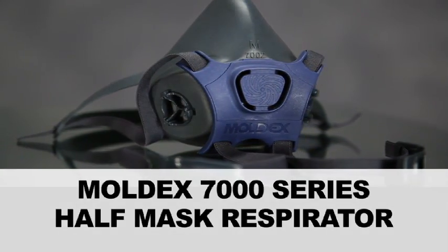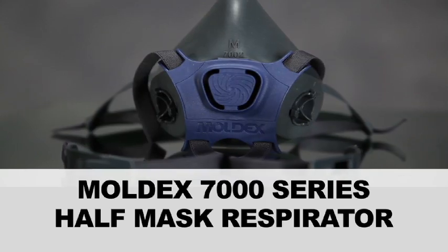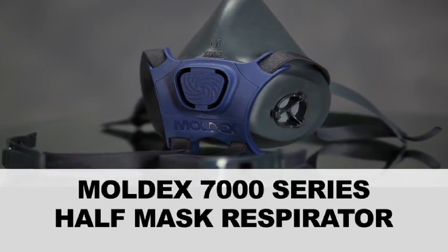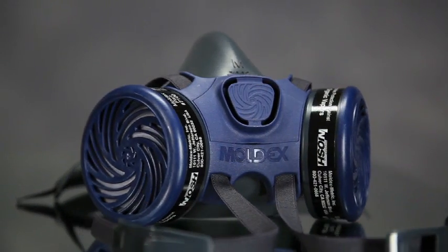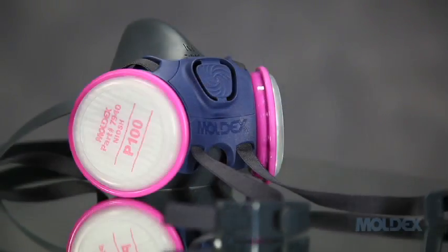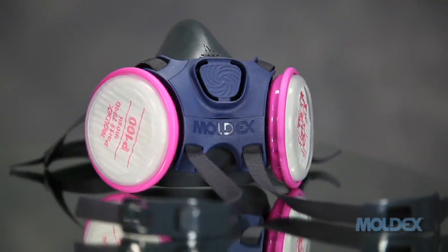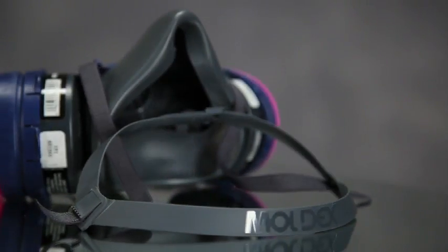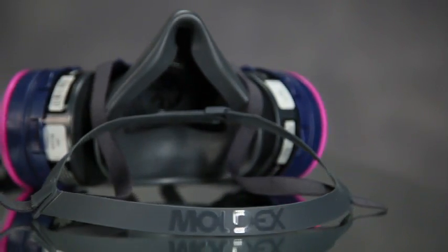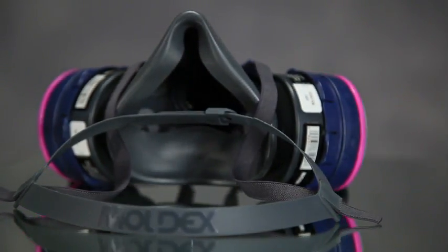Thank you for choosing the Moldex 7000 series. This half-mask respirator has been designed for both your protection and comfort. The 7000 is a half-mask respirator with a complete line of cartridges and particulate filters to cover a wide variety of work environments and jobs. This video will instruct you on the proper use and maintenance of this respirator.